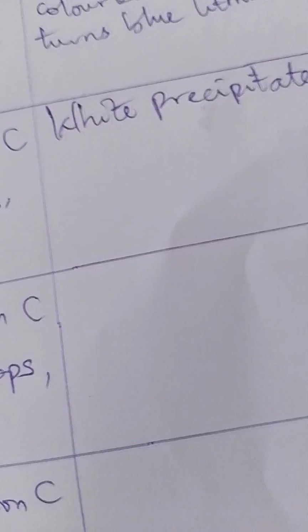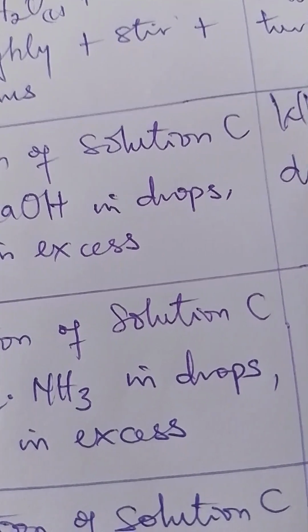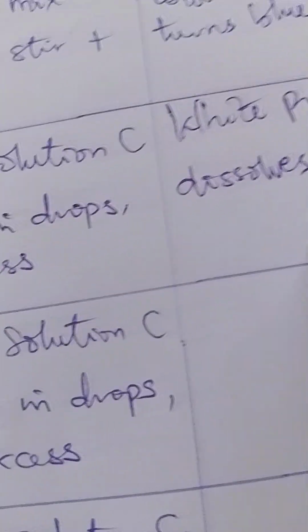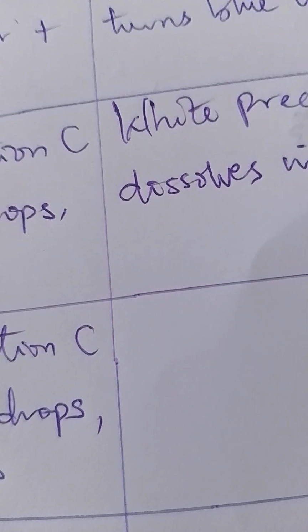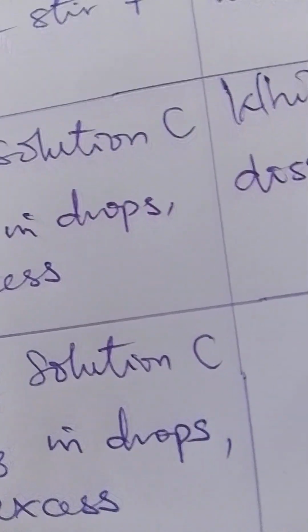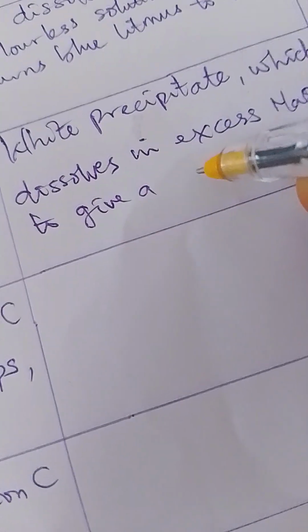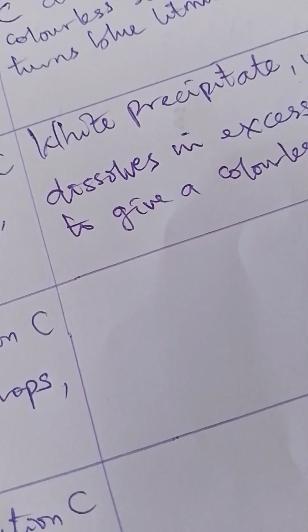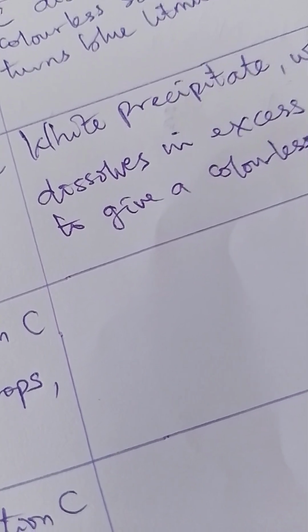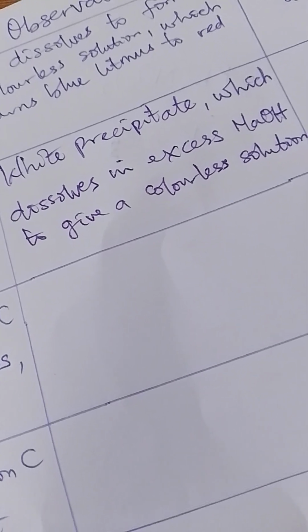White precipitate, and this white precipitate dissolves in excess sodium hydroxide to give a colorless solution. White precipitate which dissolves in excess sodium hydroxide to give a colorless solution.